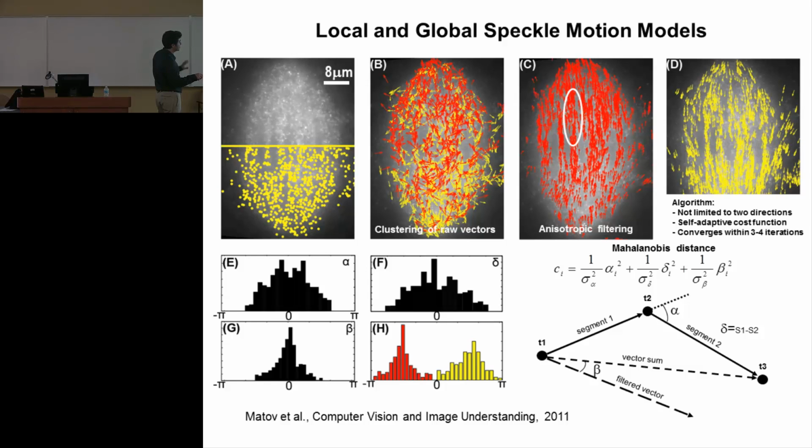First step is the detection, not talking about this today, but basically it's the statistical significance of a local maximum above background. And then the cost for linking is the angle between the 2 segments, and then the difference between the length.